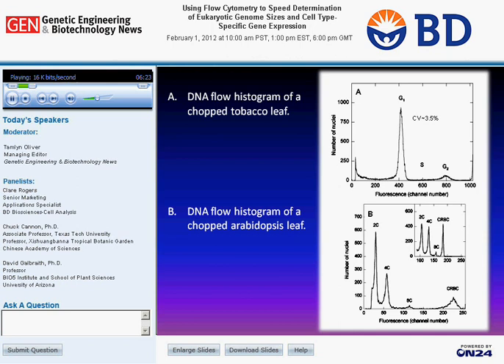And we went on to measure other plants. You can simply go into the greenhouse and take as many plants as you want, chop them up, and panel B shows chopped Arabidopsis leaf. And when we did this work, we were interested to find out that instead of having a single G1 peak with a 2C DNA fluorescence, you can see 2C, 4C, and 8C peaks.